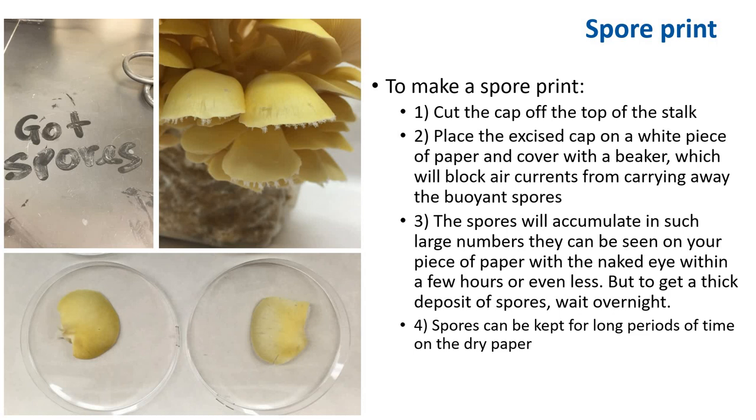Spores can be kept for a long period of time on dry paper. To do this, cut the spore print out, fold it in half, and store it in an airtight container such as a Ziploc bag in the refrigerator for long-term storage. From this cap, I put it into a petri dish. You can close the petri dish and wait for the spores to discharge.